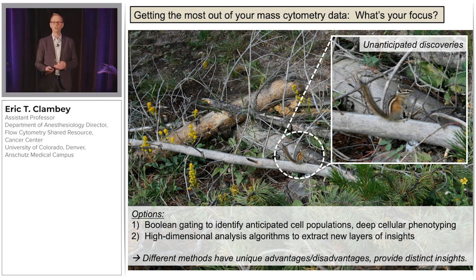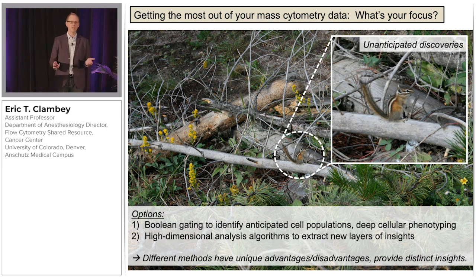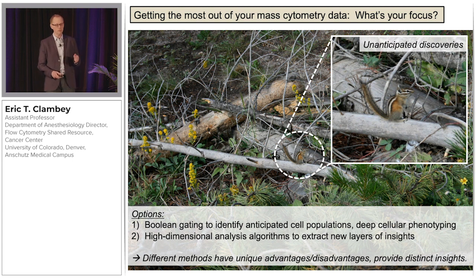So there are two broad approaches towards analyzing your CyTOF data. The first is traditional Boolean gating using biaxial plots to identify anticipated cell populations of interest, which can provide broad immune phenotyping and can be incredibly powerful in its own right. However, for those of us interested in making unanticipated discoveries, the use of high dimensional analysis algorithms is really where we hope to extract new insights from these high dimensional data.